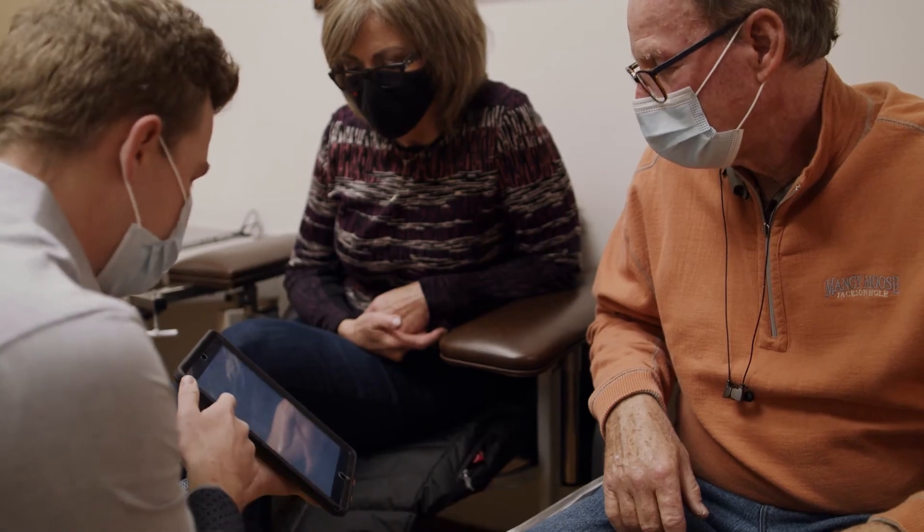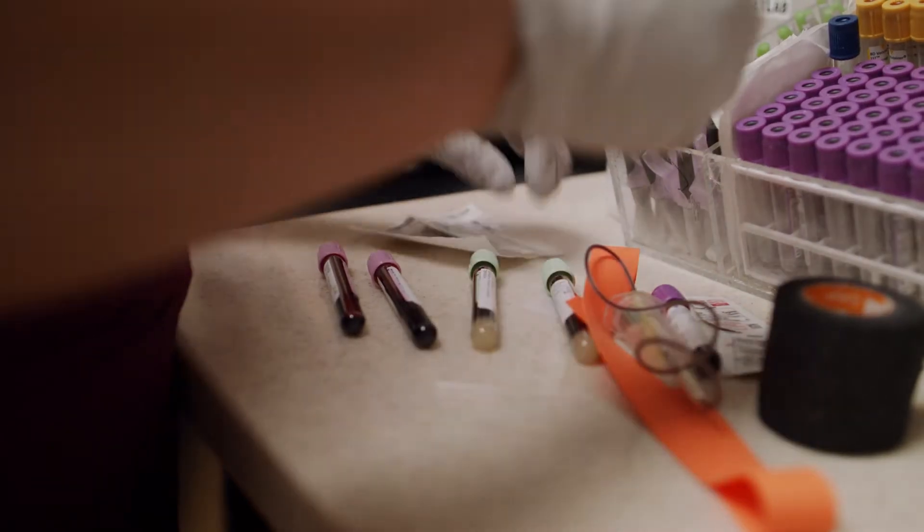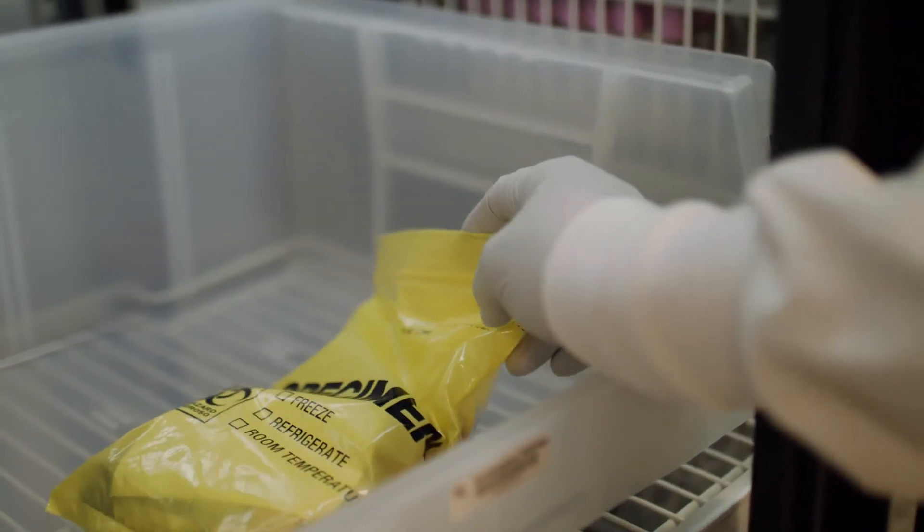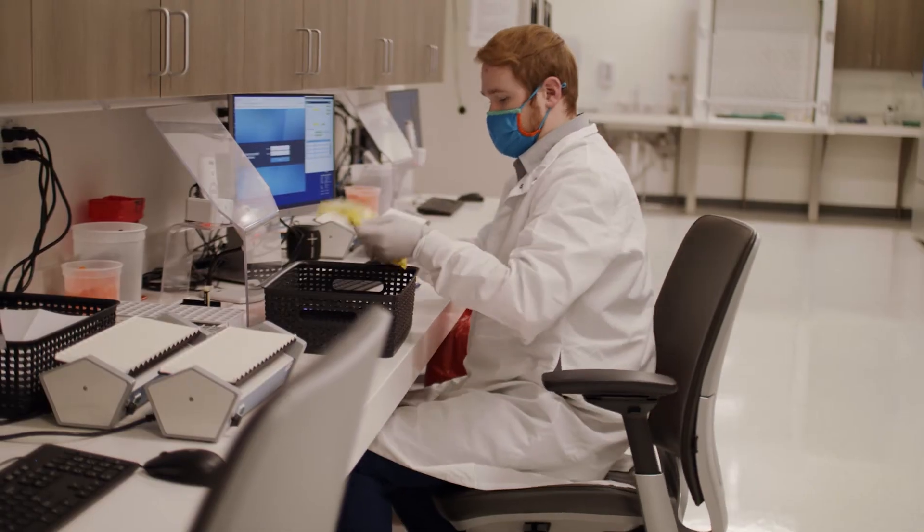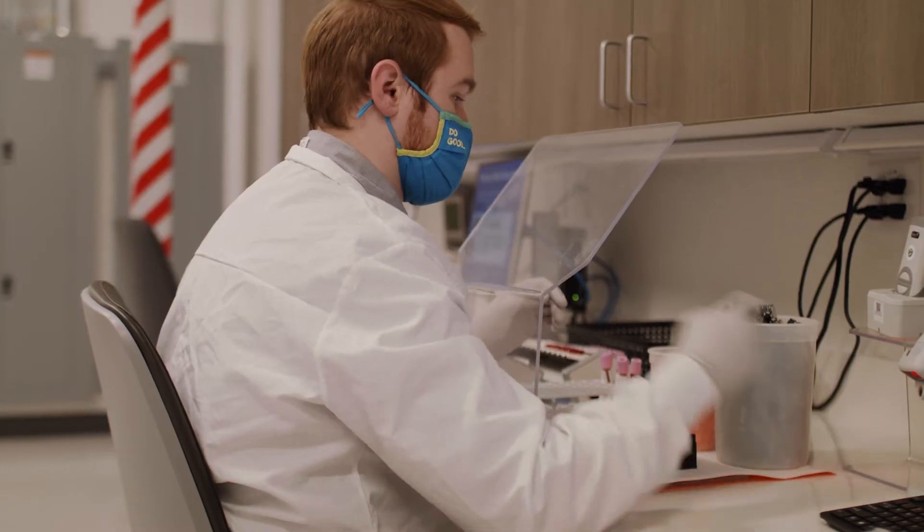When the patient consents to the study the samples are drawn, the samples are sent here for processing and storage. When the sample comes in we will track that sample and then we assign a new de-identified number to it. We can completely absolutely cut off the link to any information that might be in the hospital system.